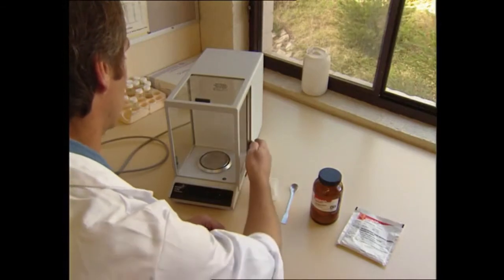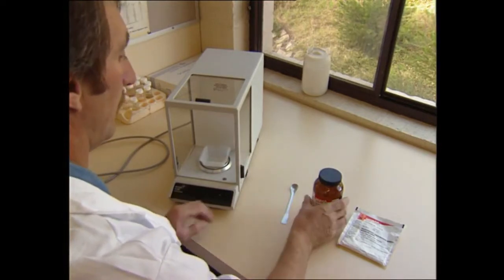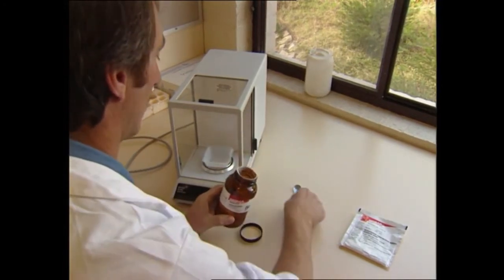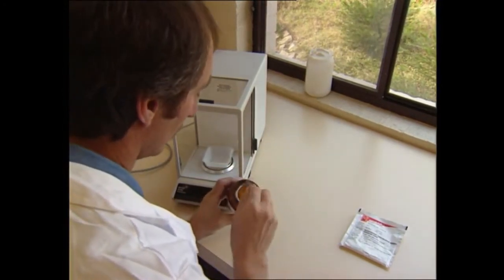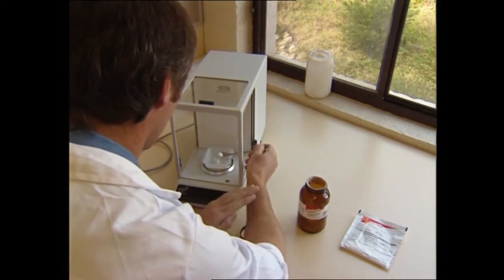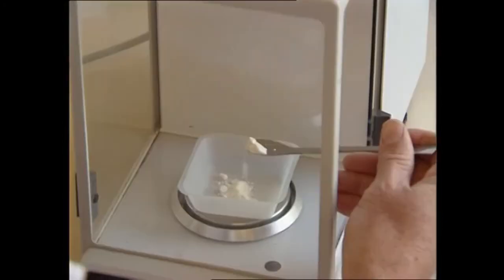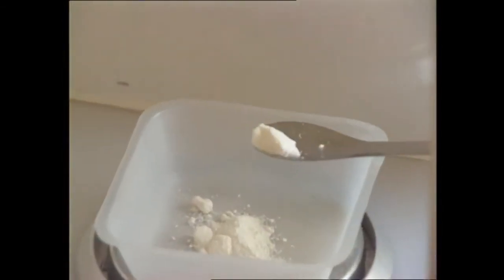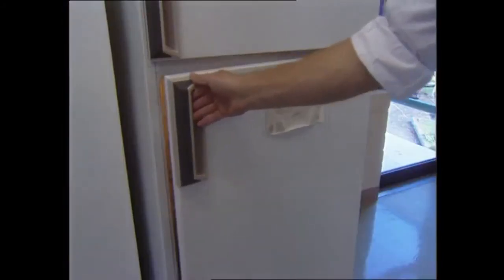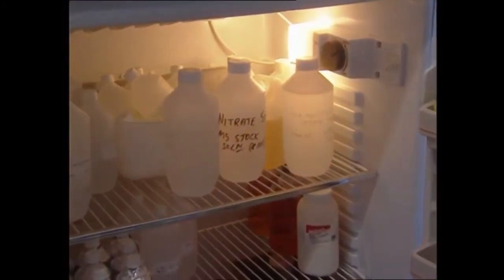If, however, we are doing a lot of media preparation with various combinations and permutations of minerals and organics, we may need to opt for preparing our own stock solutions and use them as required. Whilst this provides a lot of flexibility, it may work out to be a bit impractical for small labs. One needs to have all the chemicals and a sensitive balance to measure accurately the quantities required, a fridge to store the stock solutions, and suitable containers to store these stock solutions in.